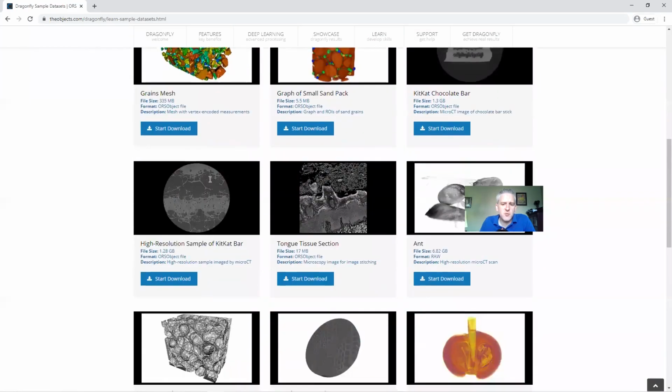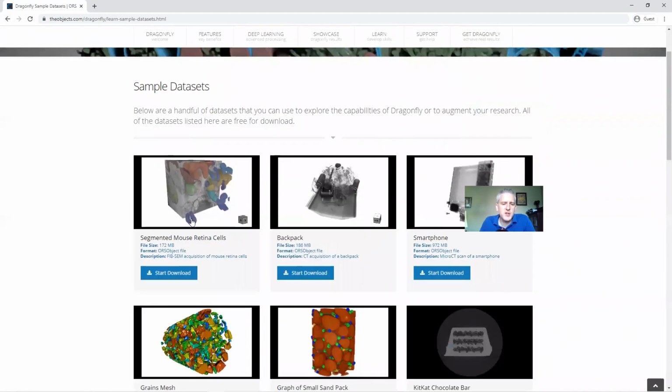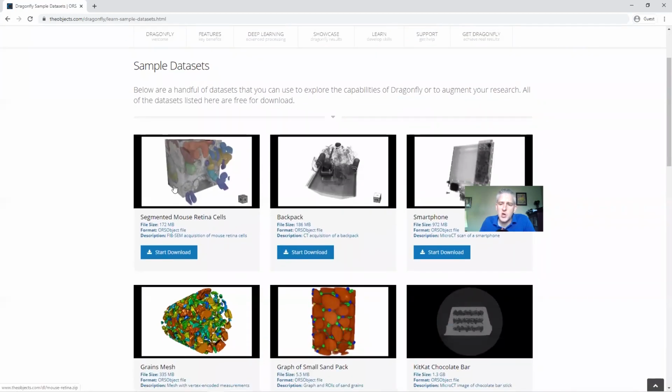So all of the data sets from the previous lessons are available, and you'll find 2 new data sets here. One is called the brick data set, which comes from NIST Visible Cement. You'll see me load that in just a minute. Another is really just noise, but it's a useful construct for illustrating some of the segmentation tools that I want to show today, some of the elementary operations. So you don't need that. You could make it on your own, but it could be handy and it won't be a very big download. Now, both of those will be available.